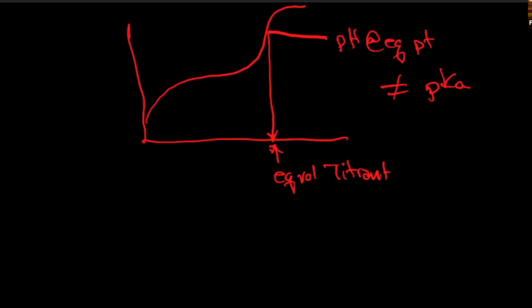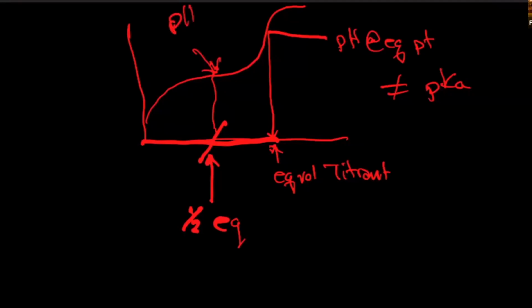It's halfway. This is halfway to the equivalent volume, and so at that point, extrapolate here, that's where the pH equals the pKa.